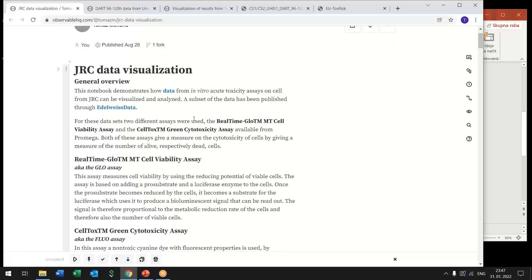So these notebooks we find quite convenient because they allow you to for example first put some introductions, some context also for non-experts so that they get some introduction about the data and about the assay.